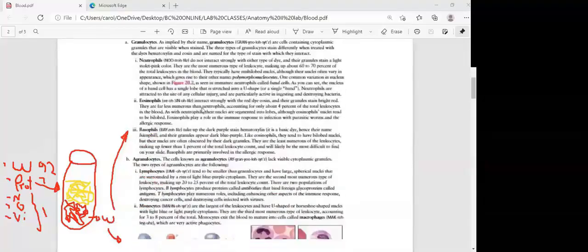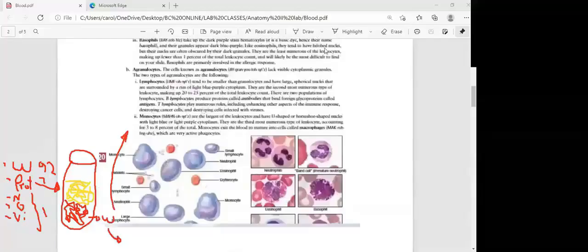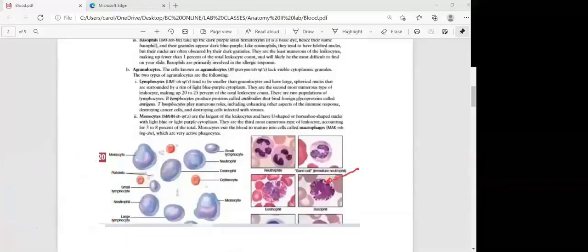If we scroll down right here, we can see the white blood cells here, right? But you can see in there the granules. There's granules in here again. The other ones are going to be the agranulocytes. For example, you can take a look at this one right there, right? It shows no granules in there. Okay, so then let's keep moving.